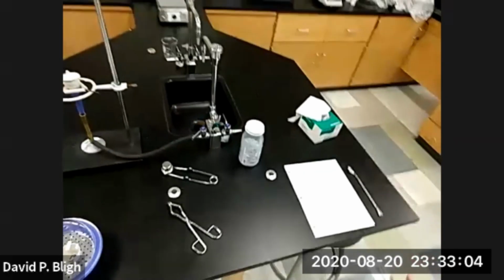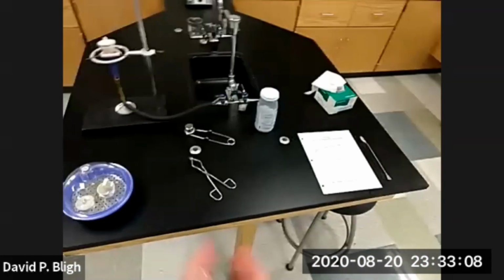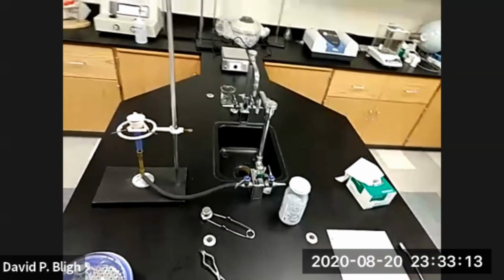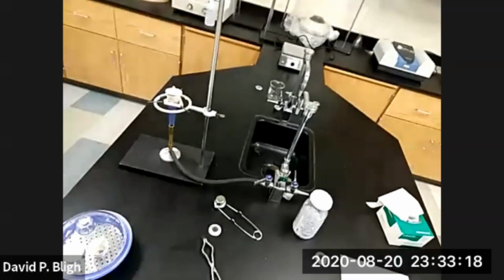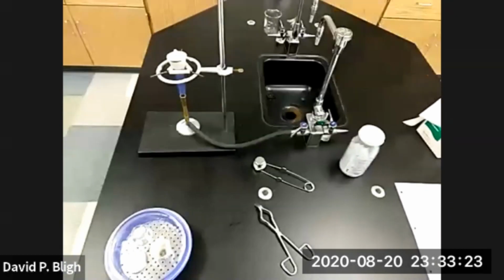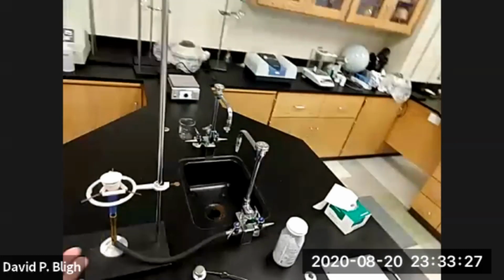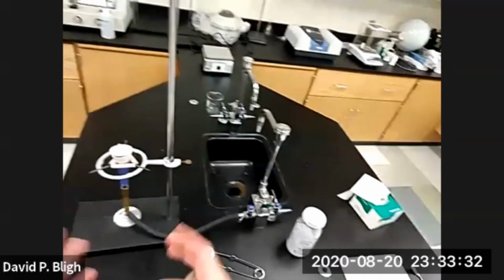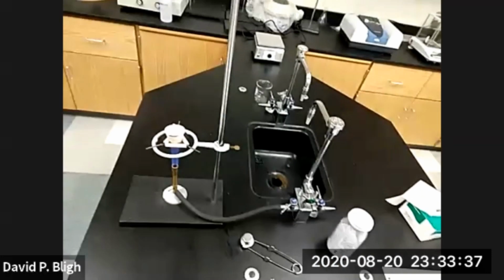So while we're waiting, let's talk about safety. All right, you need a safety blurb. So what about this whole procedure requires safety considerations? The first obvious one is heat. The burning gas presents a burn hazard, and anything that it heats presents a burn hazard. Touching anything that's come into contact with the heat or the hot crucible, that's why we use tongs to manipulate them.